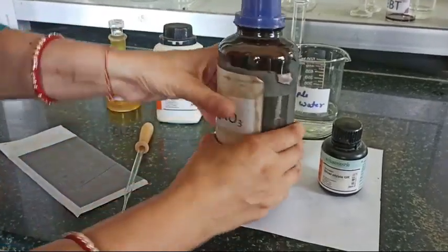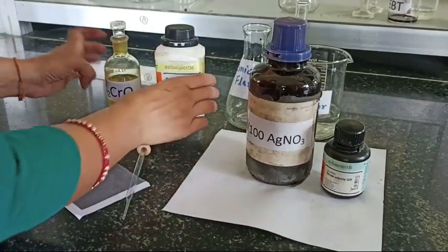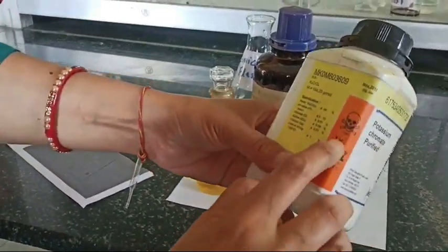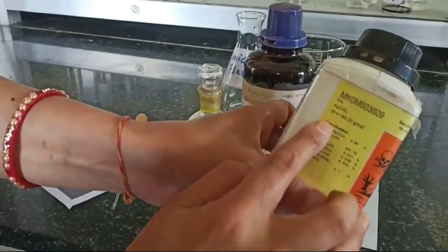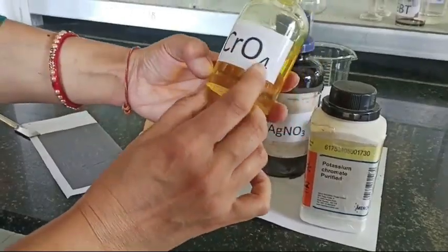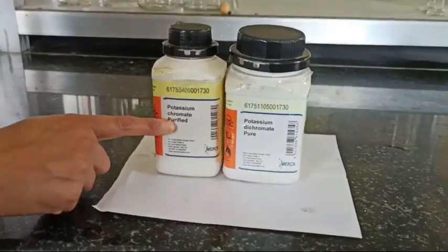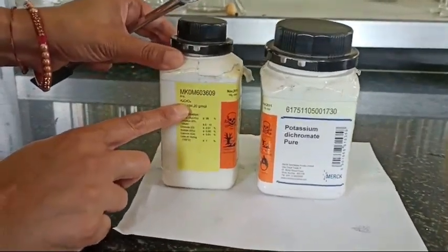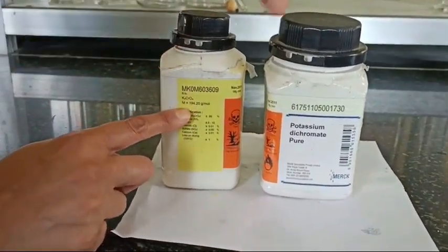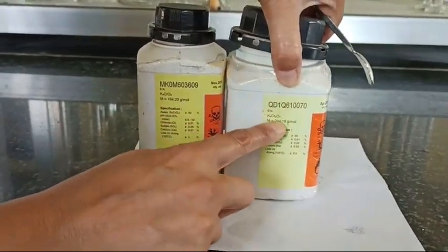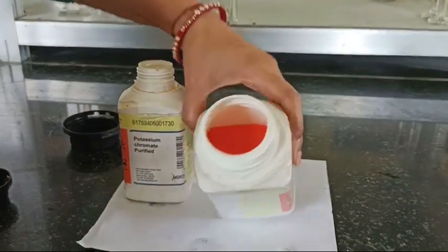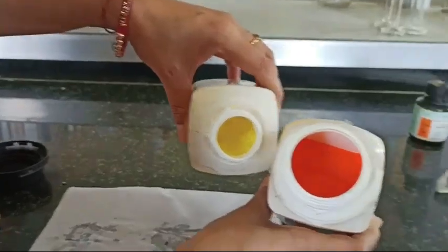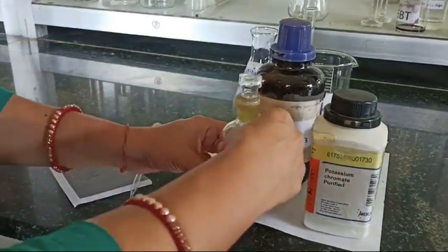This is potassium chromate. Potassium chromate is used as an indicator. Students get confused - this is K2CrO4. Students get confused between potassium chromate and potassium dichromate, so let me give you the explanation. Here it is K2CrO4 and here it is K2Cr2O7. So K2CrO4 looks like this and this is K2Cr2O7 how it looks like. So you can differentiate between these two.